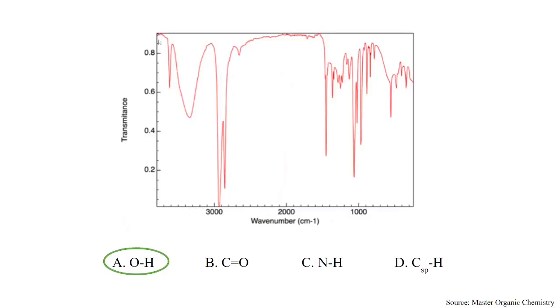roughly around 3400 or 3500, those are typically alcohol peaks, and depending on how they're orientated, you can have either a regular alcohol or a carboxylic acid, right? If you have a carboxylic acid, this alcohol peak has to be merging with the CH peak here.